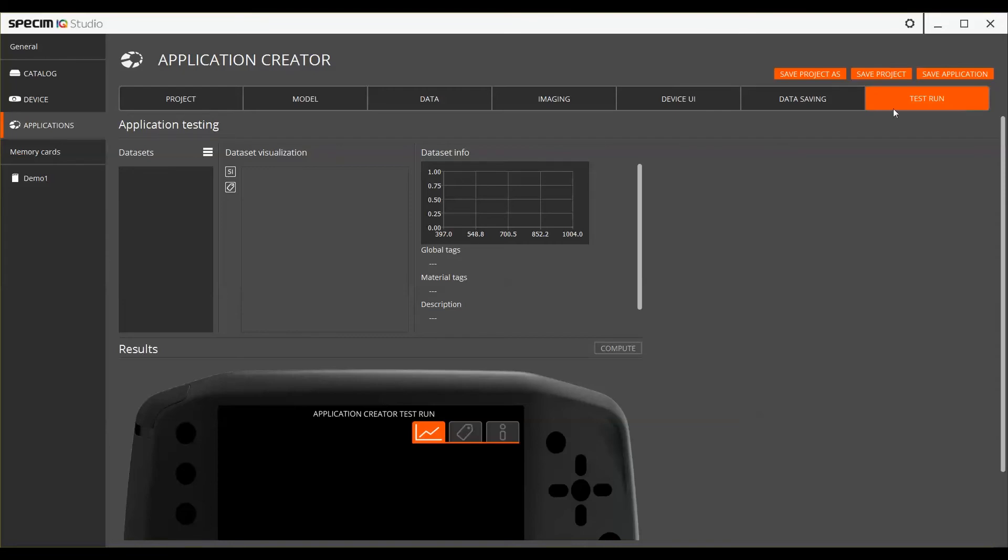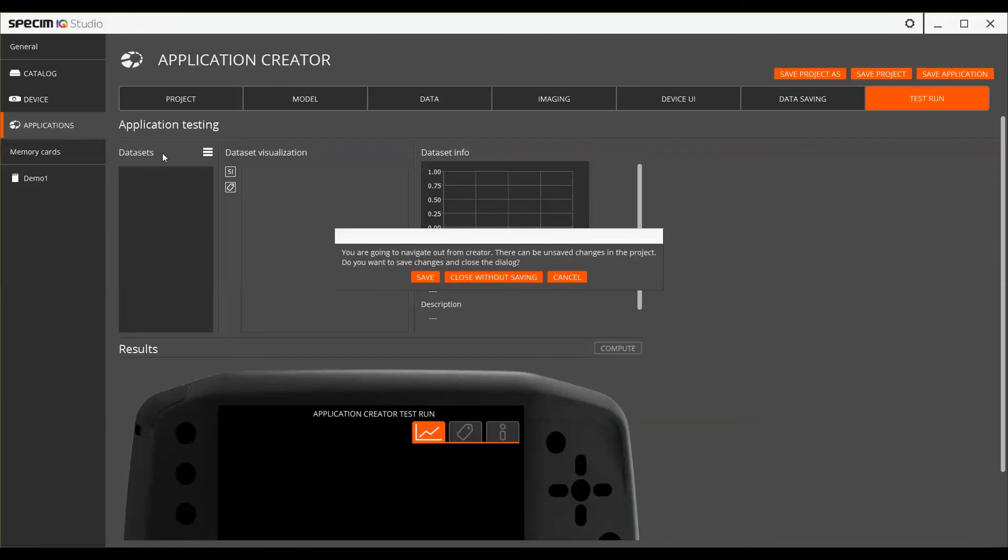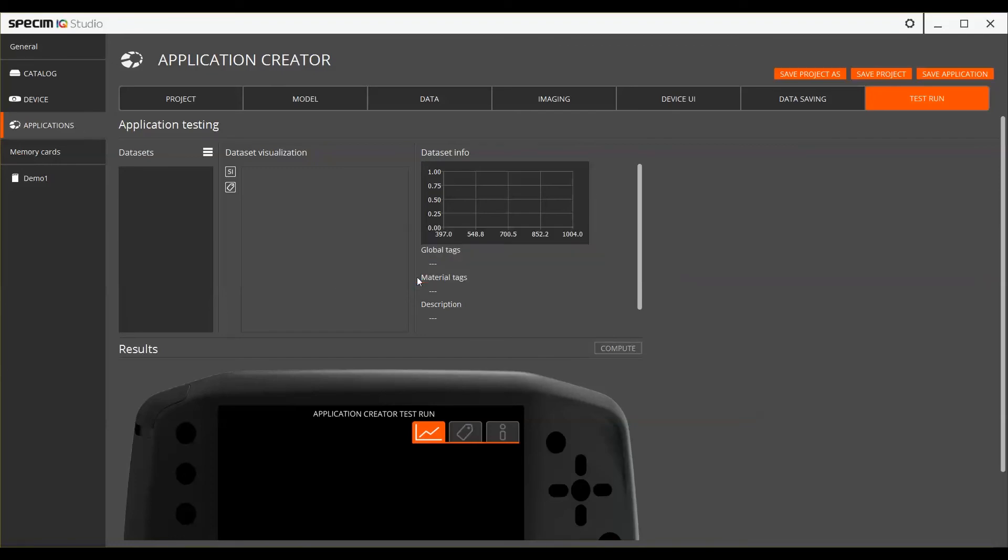Created applications can be loaded to the Speciem IQ device one by one or they can be included as part of a profile.